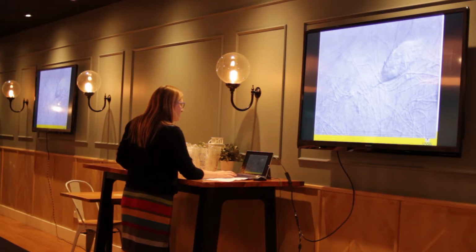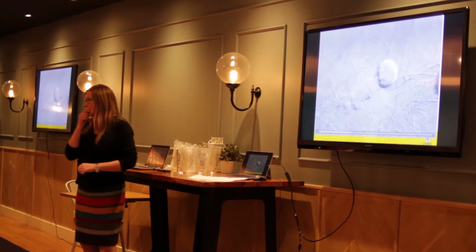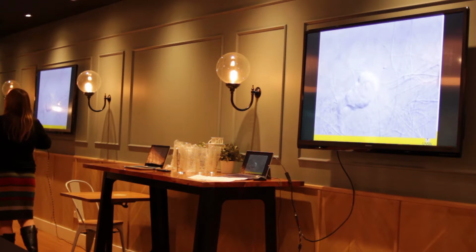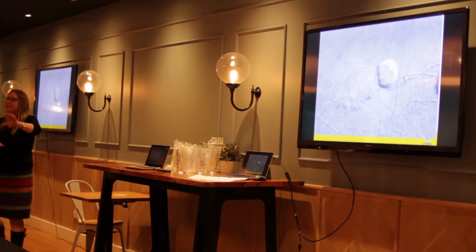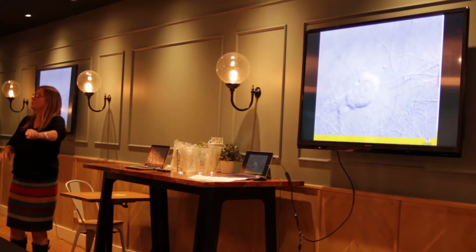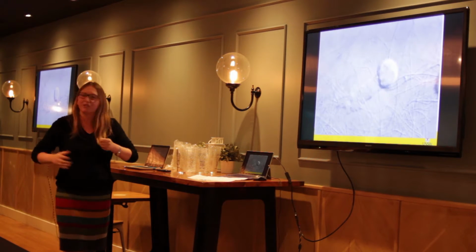Now, that's a cancer cell. Okay. What you're seeing it do is actually crawl along collagen fibres, things that actually make and mesh up all your cells together. What we do is we can see the cancer cells actually grabbing hold of the collagen fibres to pull themselves along. Pretty freaky, right?